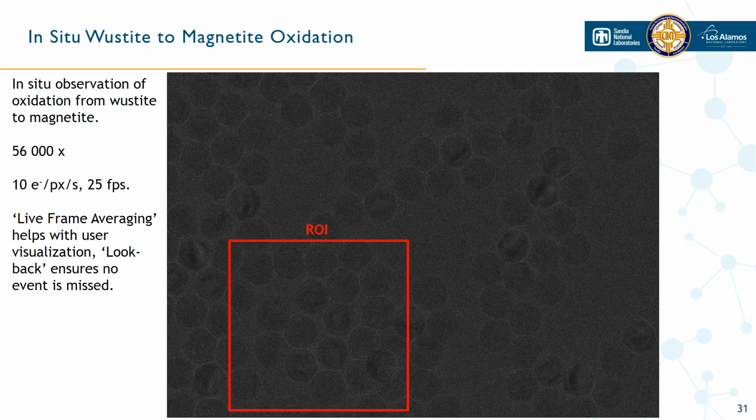So now we're moving to in situ. With the high speed and low dose, we're excited about the K3 because this is in the TEM, so we are at temperature and we are flowing oxygen gas. There are already a number of variables in the system, so introducing a high energy electron beam can obviously kick off some transformation, perhaps earlier or later, and you want to be able to mitigate the influence of the beam.